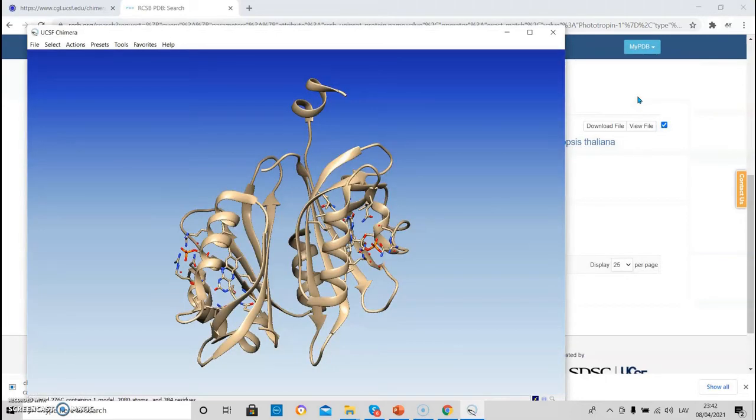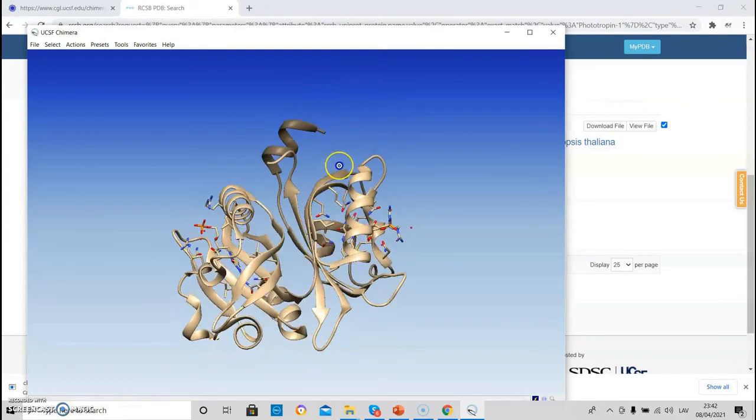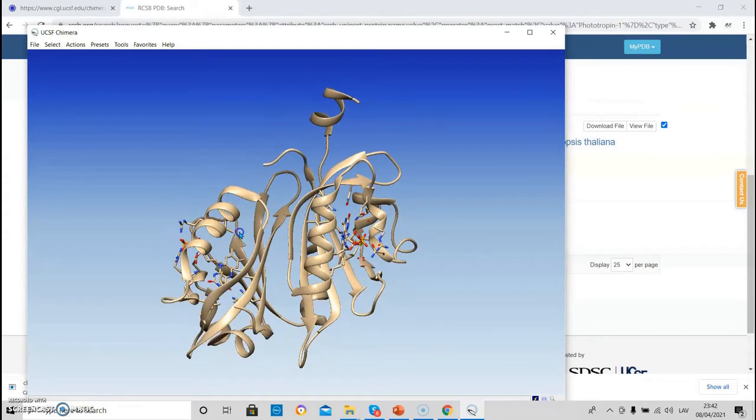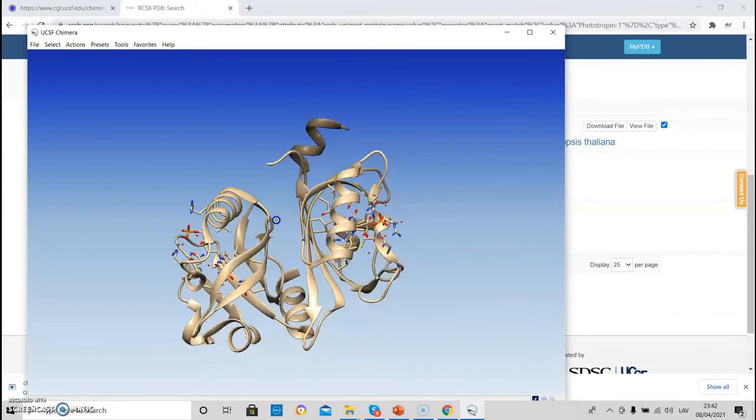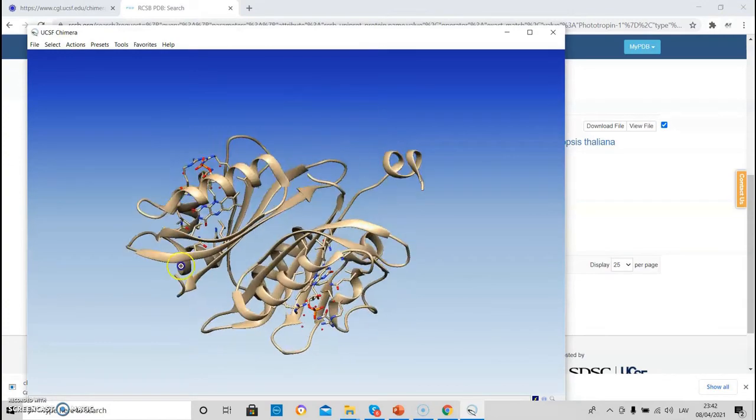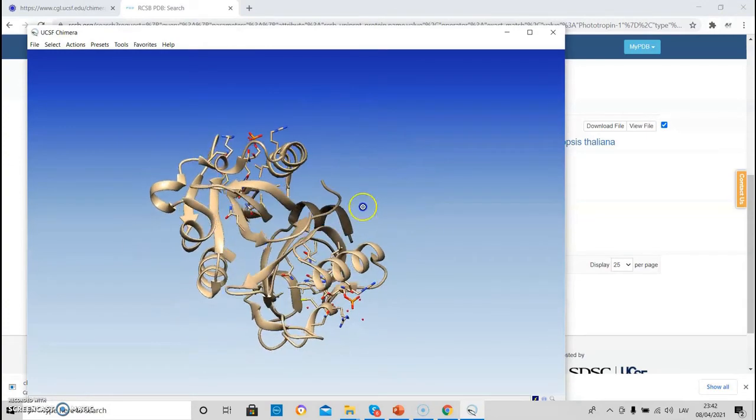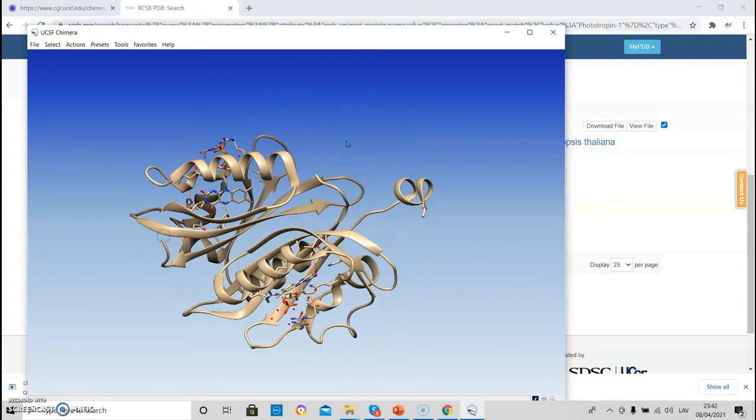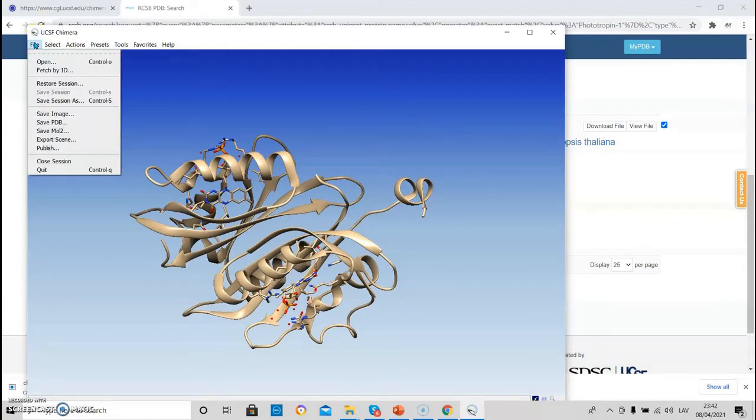And it opens the corresponding structure. Paste the structure ID, and it opens the corresponding structure.